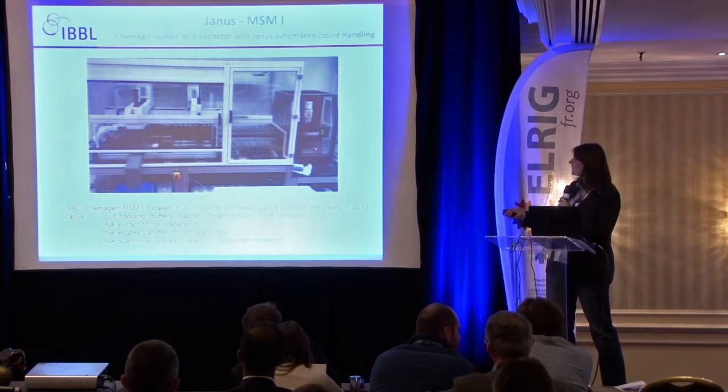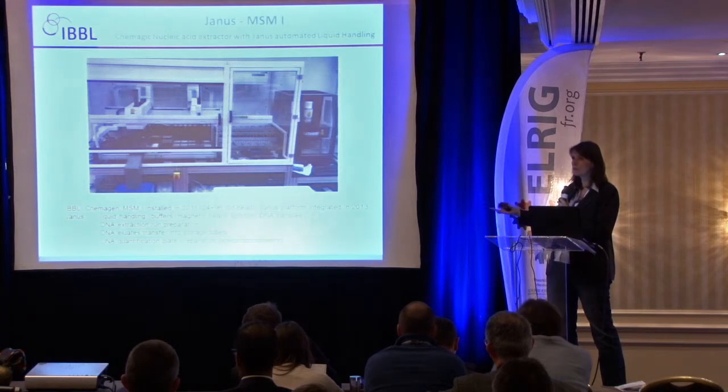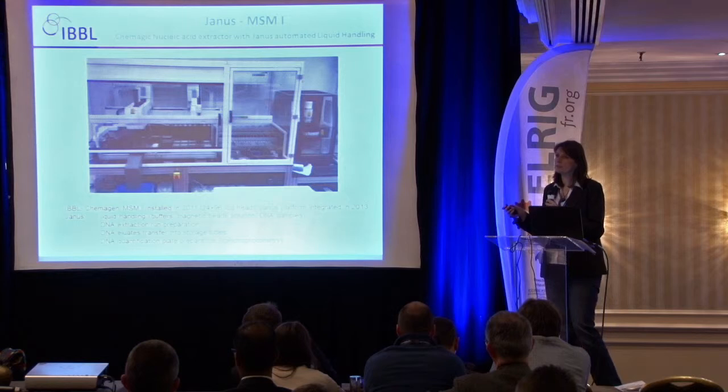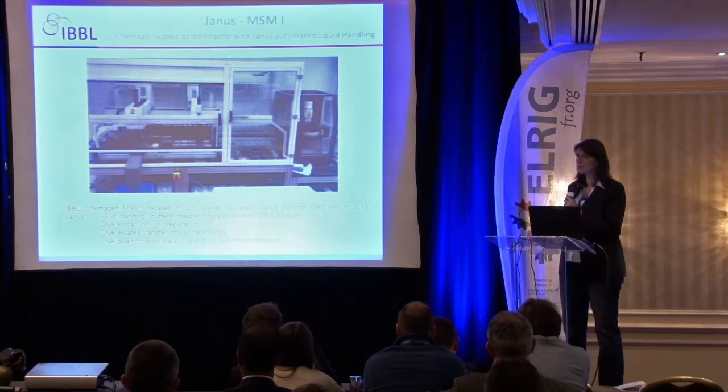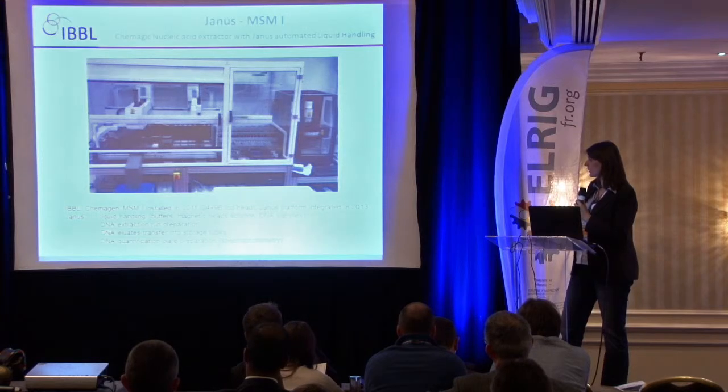Afterwards, it goes into this machine, and the extraction is done, that part fully automated. When it comes out again, it's in a rack. So you still need to transfer your DNA eluates into tubes. So also this, the Janus can do. It will transfer the DNA eluates into storage tubes.